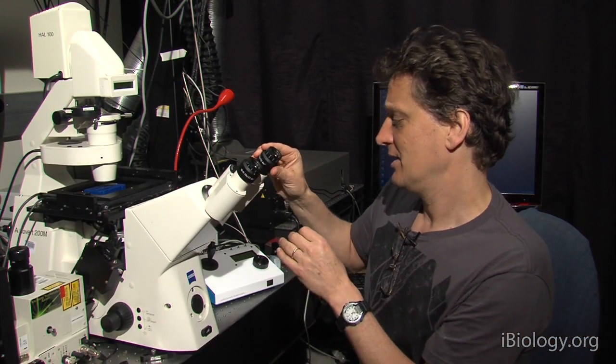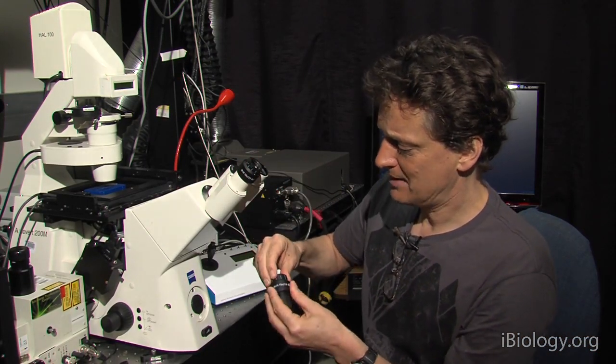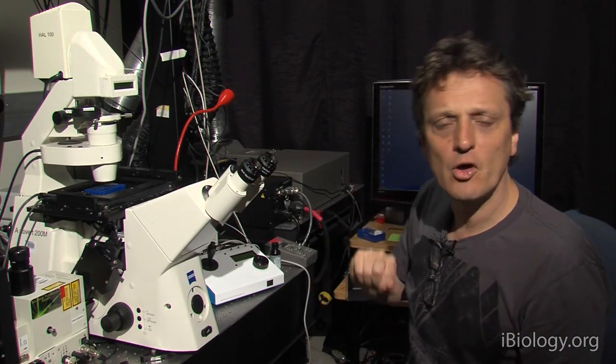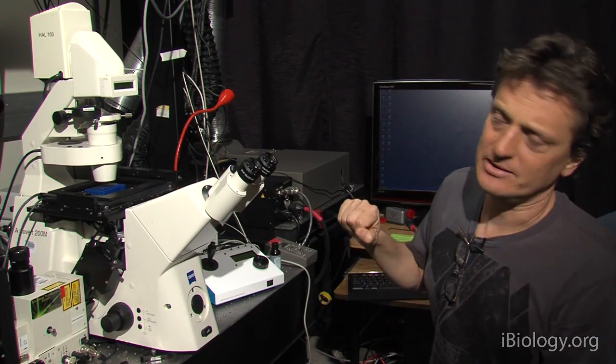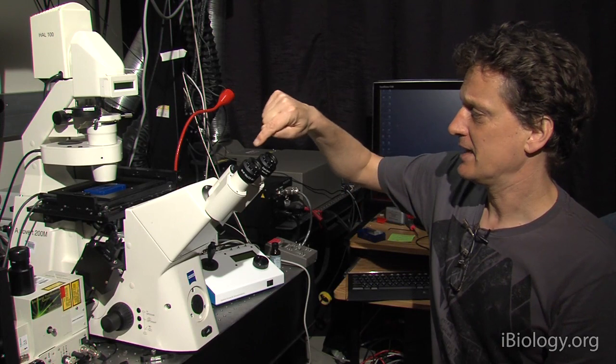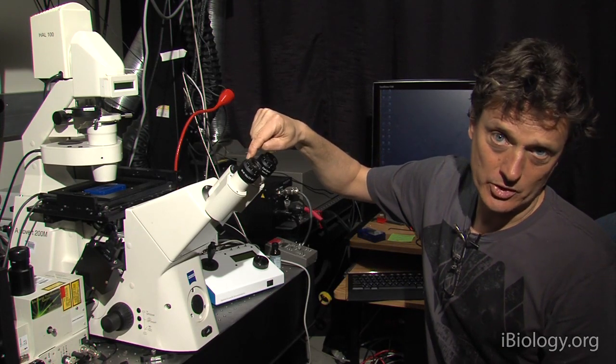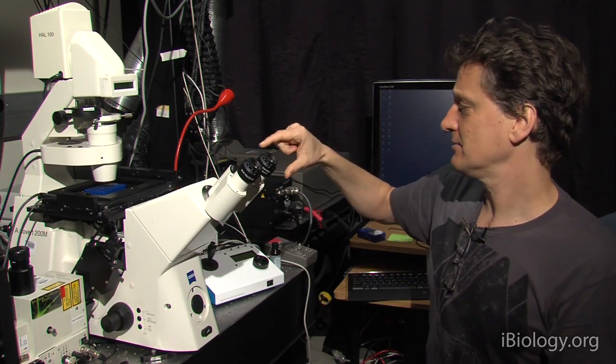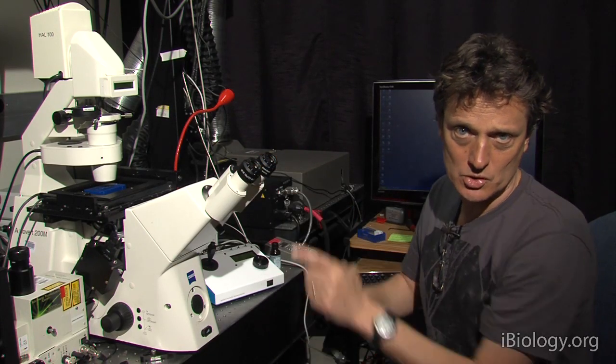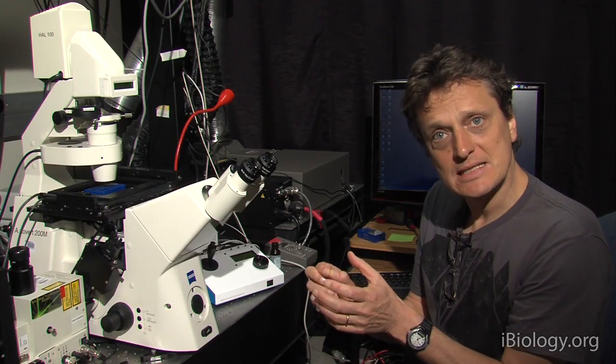Now, another issue with the eyepieces is that you will often encounter that the image on your camera is not in the same focal plane as the image that you see through your eyepieces. And that is because the camera is focused to slightly a different plane than the image you observe through the eyepieces. In the ideal world, we would have a focusing C-mount.